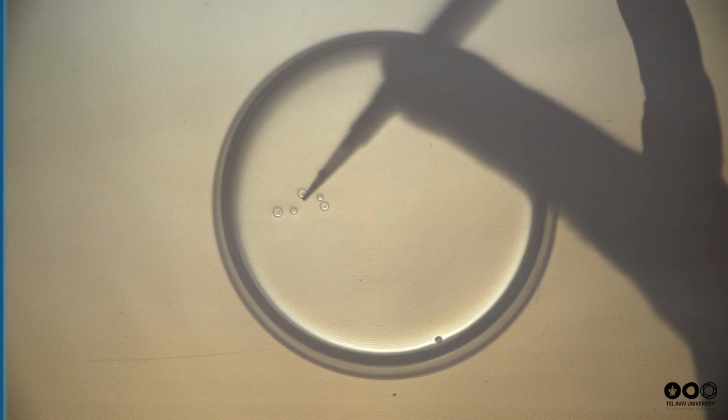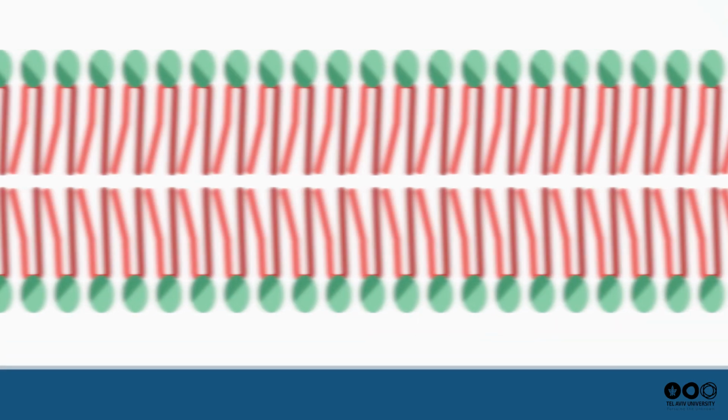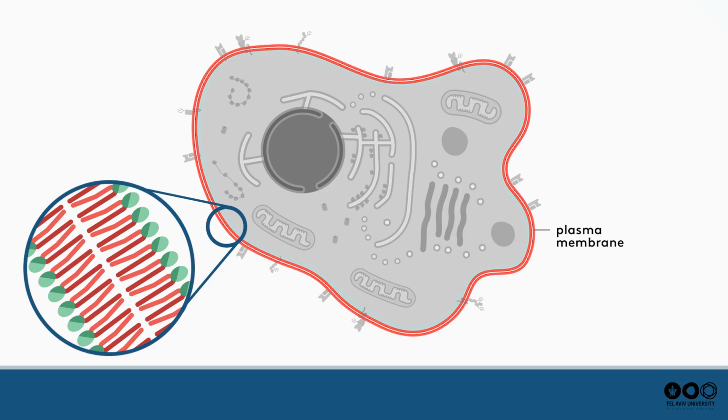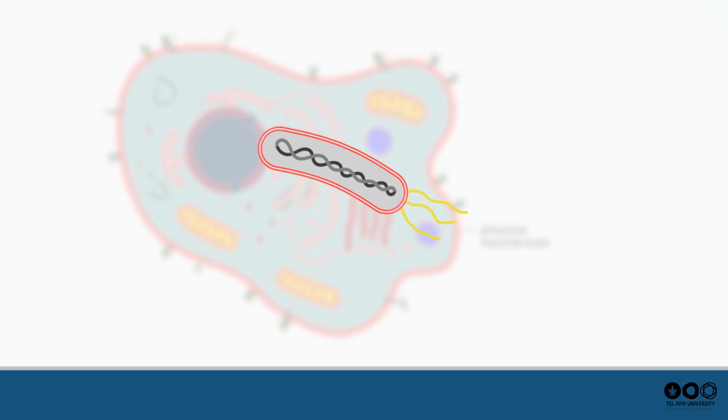In the last lesson, we learned about hydrophilicity and hydrophobicity, and how soap, a detergent, can bridge between both worlds. We learned that lipids are amphipathic molecules that assemble to form cell membranes. All cells are surrounded by lipid membranes, even bacteria. I wonder how soap affects bacteria. You know what? Let's see and find out.